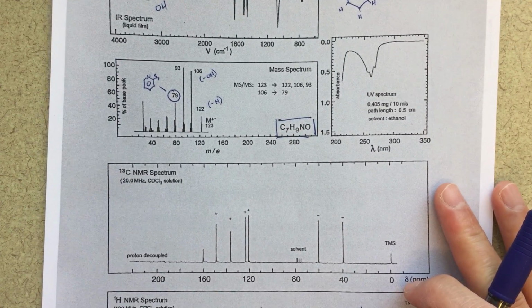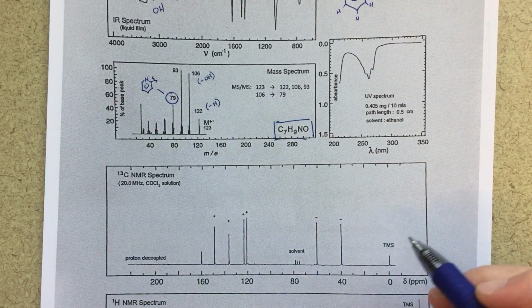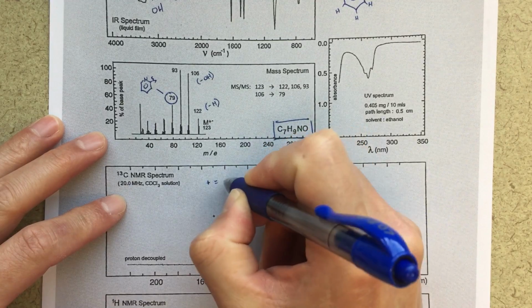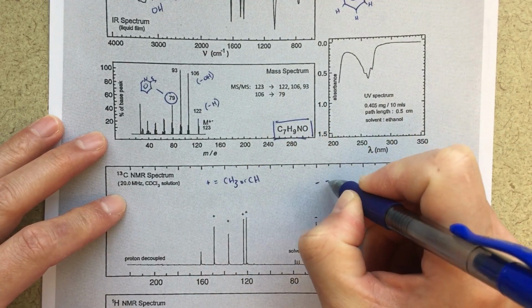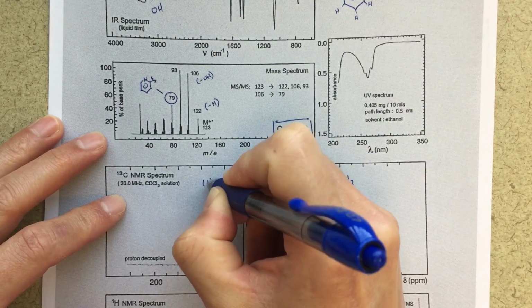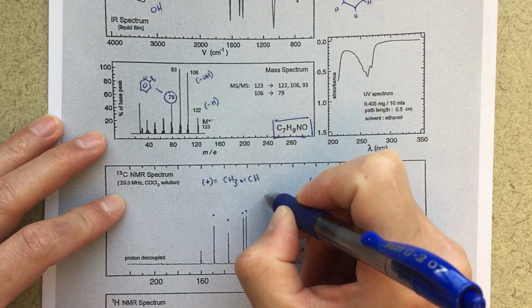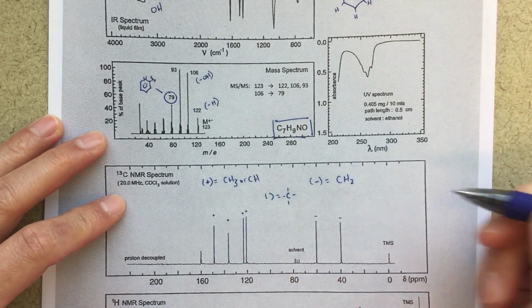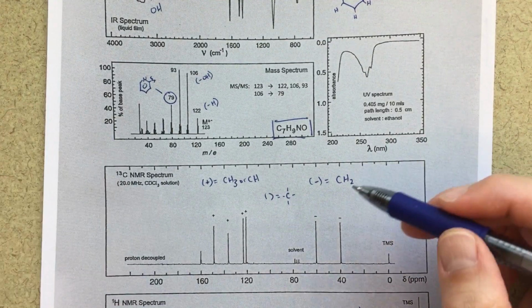The last thing I'm going to talk about is the carbon-13, to make sure that all makes sense. It's a little bit unclear, but I think what this is letting us know is that these pluses equal CH3 or CH, and minuses equal CH2. I'm going to put that in parentheses so it's very clear. And then this peak over here, if it's nothing, equals carbon with 4 bonds to it, or just no hydrogens, basically a carbon with no hydrogens on it.